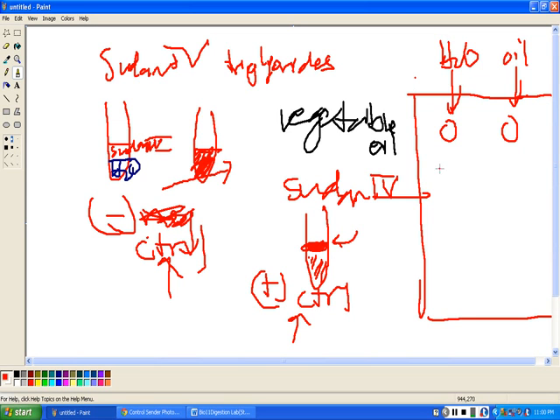What do you expect the water portion will look like after we let it dry for 10 minutes? It's going to dry out. It will leave a little water spot, but it's going to be dried out. Versus the oil spot here, it's going to still stay wet even though we let it dry for 10 minutes. It's going to still look like it's a little wet. So that's another way of testing your unknown.